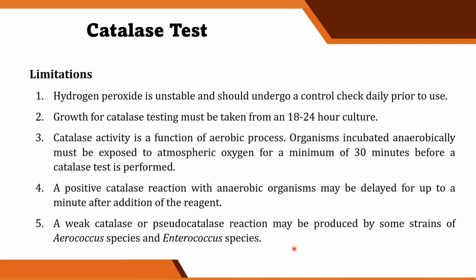So, bakit siya hindi true positive test? Kasi, ang tinatest natin for the catalase test is the presence of the catalase enzyme, di ba? Yung Aerococcus species kasi and the Enterococcus species, they have peroxidase. Okay, so peroxidase slowly catalyzes the breakdown of hydrogen peroxide.